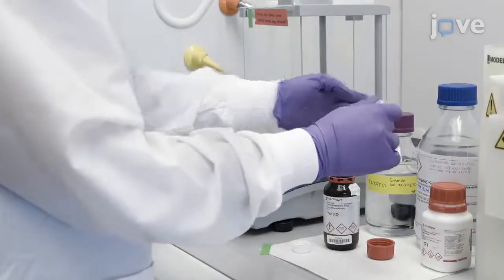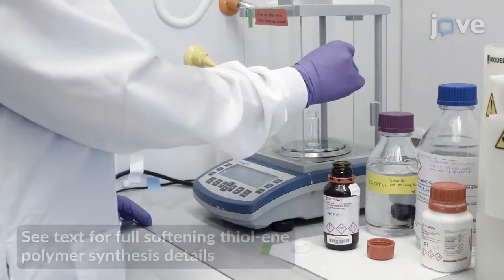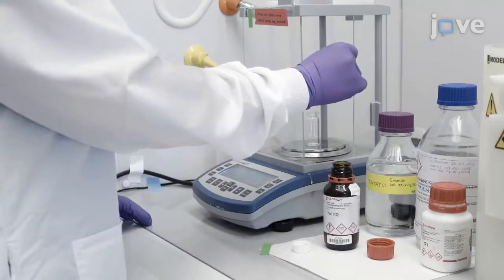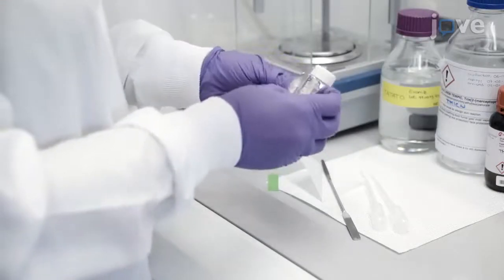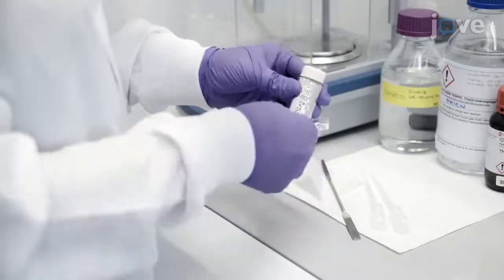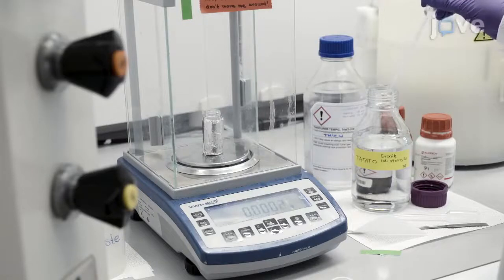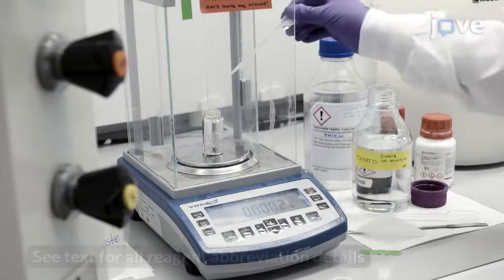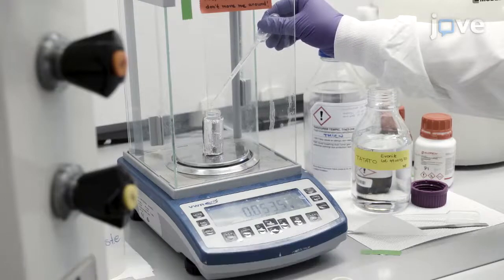Begin by mixing quantitative amounts of thiol to alkene monomers with a total of 0.1 weight percent photoinitiator. Cover a 20 ml glass vial in aluminum foil to prevent incident light from contacting the monomer solution. Then use a disposable plastic pipette to add 50 mol percent TATATO, 45 molar percent TMTMP, and 5 molar percent TMICN to the vial.